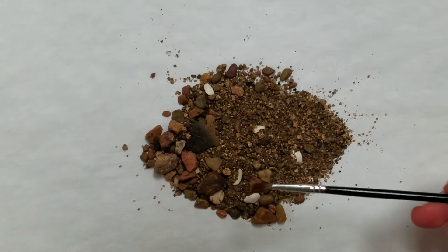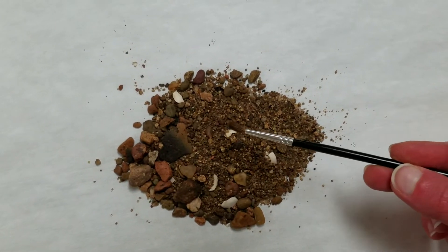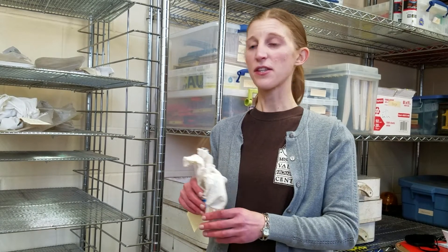After the light and heavy fractions are dry, we can sort through them to find things of interest. So that's a quick introduction to flotation. If you're interested in learning more, please check out our longer video.